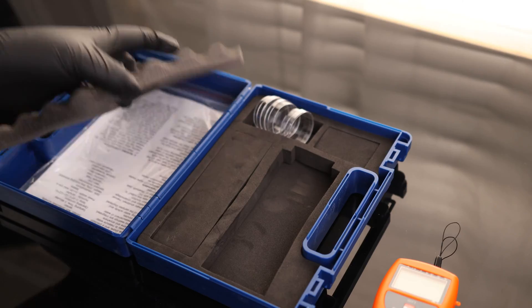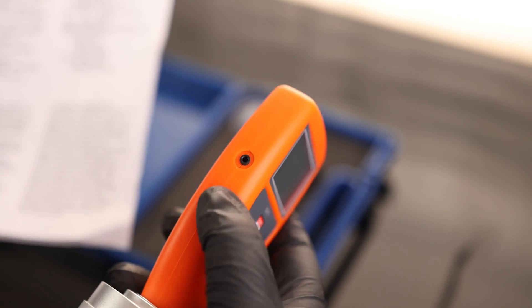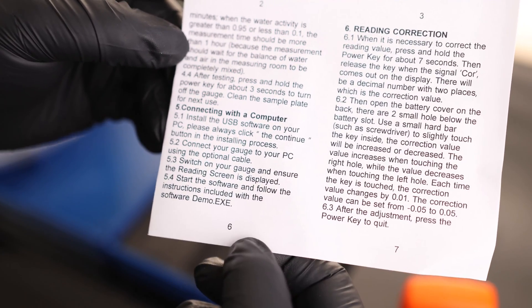We have three testing containers and instructions on the front. There's a power button on the left side and a port for a cable so we can connect this to a computer, but it does not come with a cable — it calls this an optional cable, so you're going to have to buy that separately or find something else that would work.